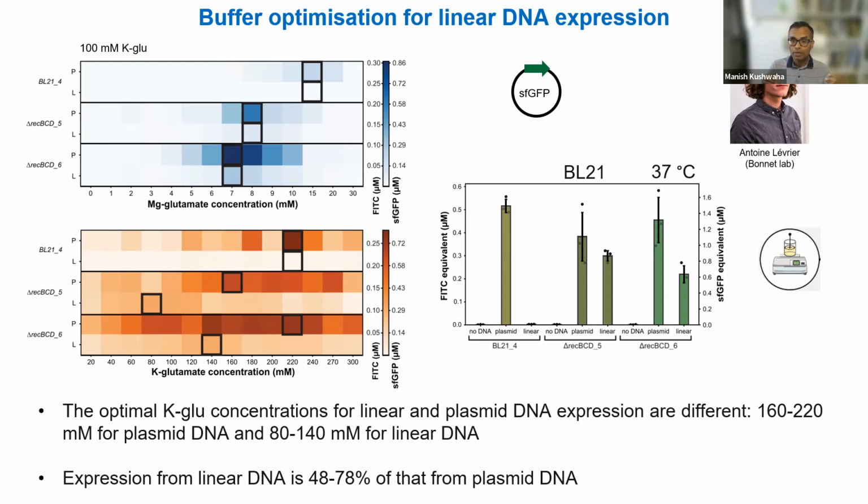So as a result, in this particular study, we did many of these experiments, both in the Montpellier lab and in the lab in Paris, and we compared results. And we, in fact, did it at slightly different conditions as well. So the Montpellier lab likes running their extracts at 37 degrees, and they use French press to make the lysates. We here in Paris use sonication to make the lysates. We run our experiments at 30 degrees.